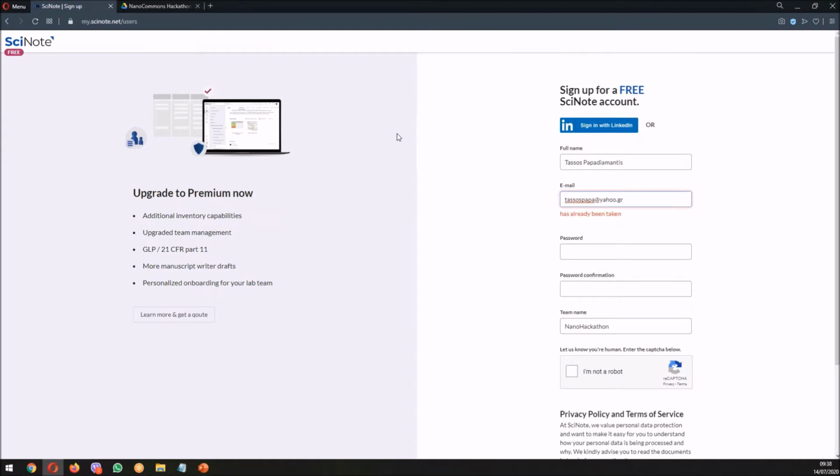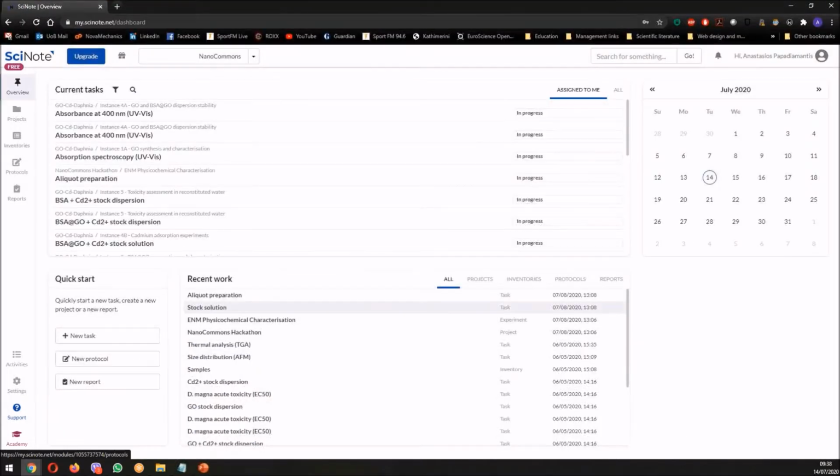Okay, so when you do that, sorry about that, you will go into the overview of your account. So this is my main account, more or less. When you go in, you will see a number of pieces of information: current tasks that might be going on, a calendar of what has been planned, recent work, and so on, and then some quick start buttons that we're going to go through very fast in the process.